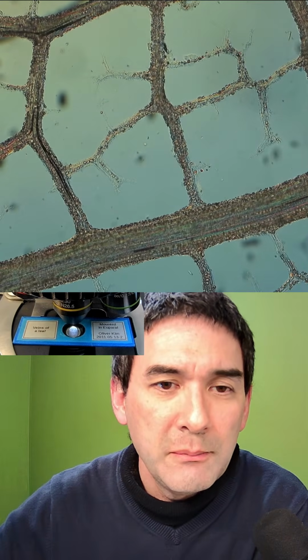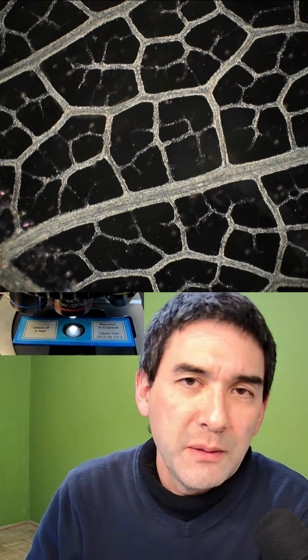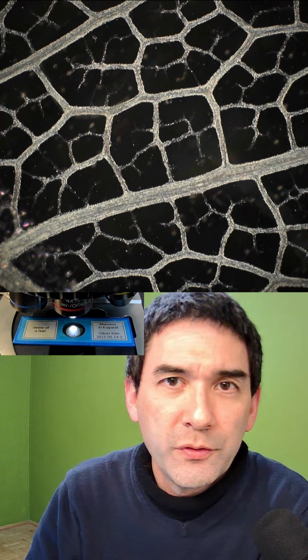And I made a permanently mounted slide of that, and I'm going to, of course, also turn off the arrow. And usually they look quite nice under low magnification. And look what's going on here. This is now dark field, and this was quite a long preparation. Maybe some of you do remember this from a few months ago.